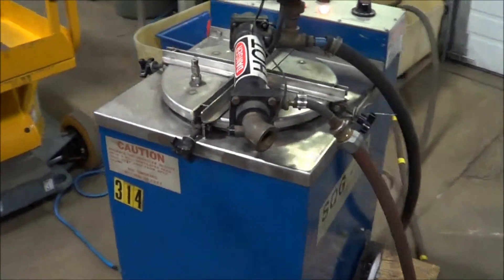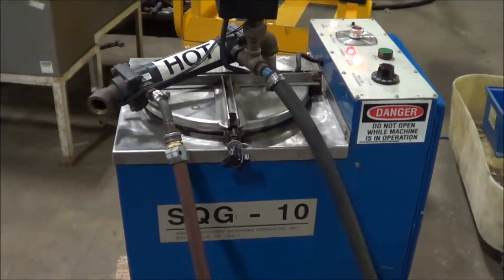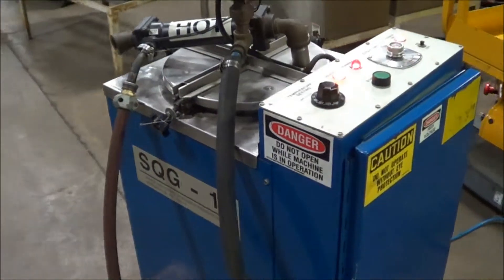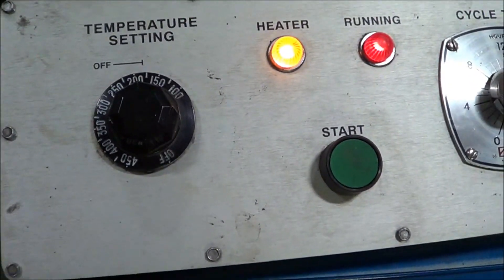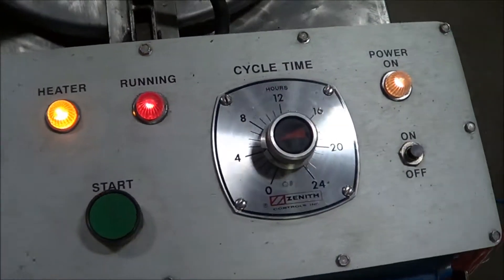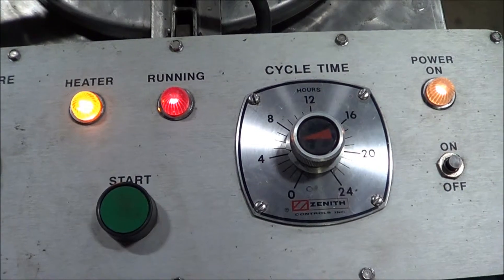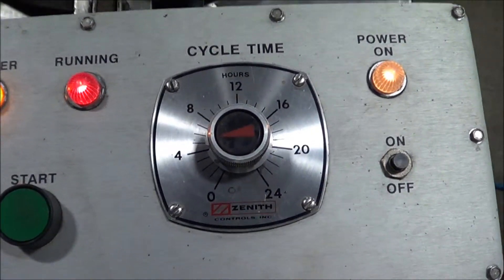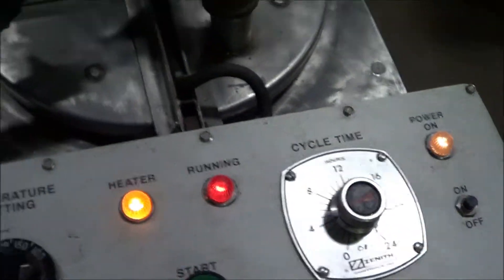It has a temperature setting of 100 to 450 degrees Fahrenheit and a 0 to 24-hour timer. It's made out of 304 stainless steel for the interior. The control panel has the temperature setting and indicators that it's running. It will shut off if water is not running to it. It also has a timer and on, off, and start buttons.